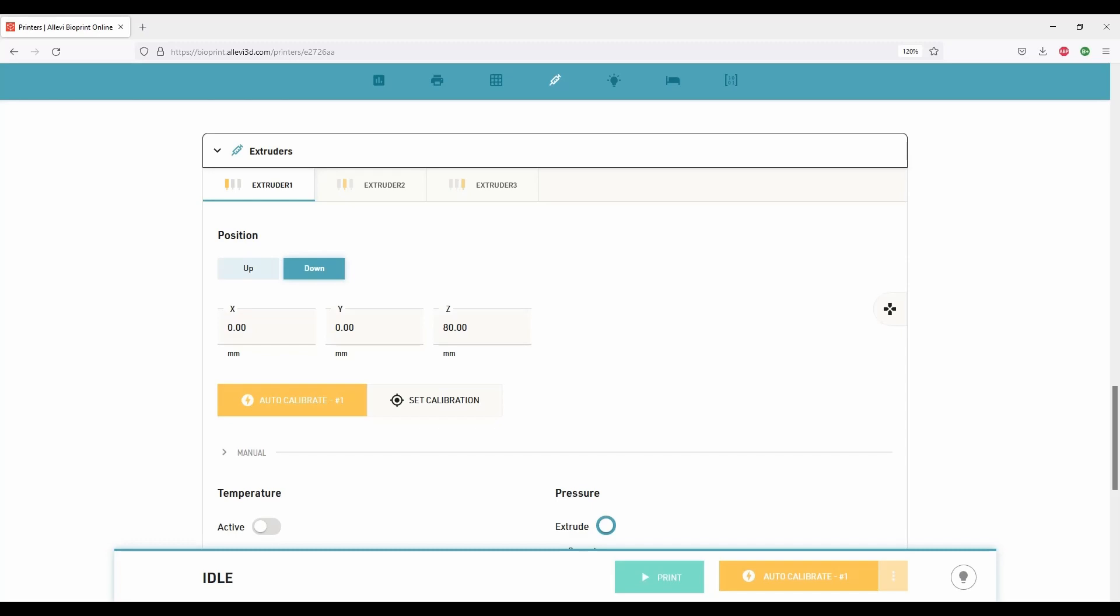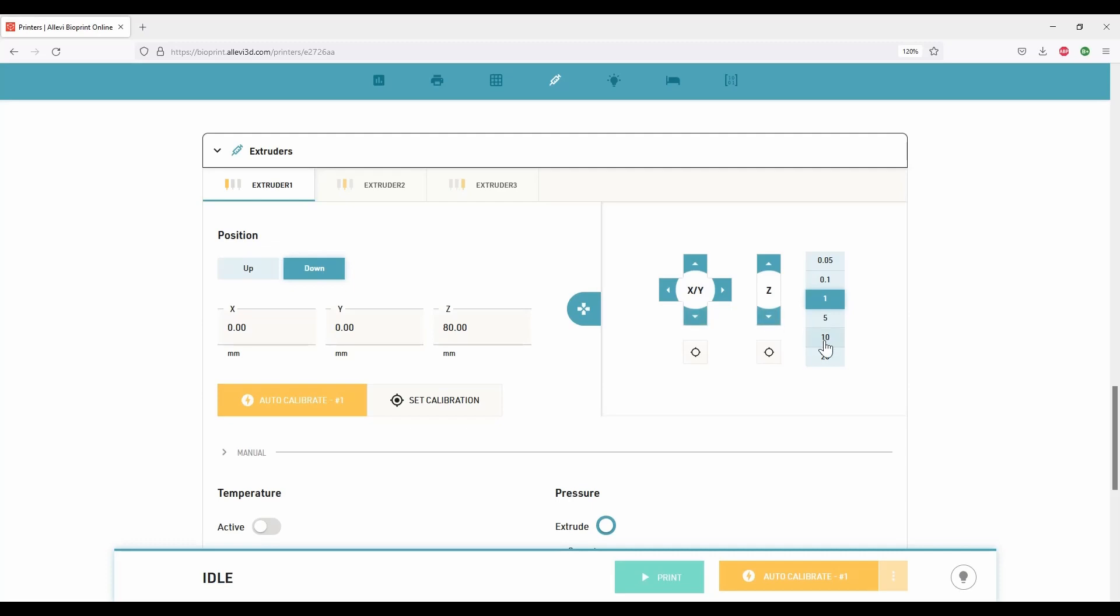If you prefer to choose manual calibration or when working with multiple extruders, the calibration steps are as follows. Click on this icon to expand the controls to move the extruder along X, Y, and Z axis. Remember, the extruder moves along X and Y axis while the print bed moves along Z axis. Choose appropriate step size and move the extruder.